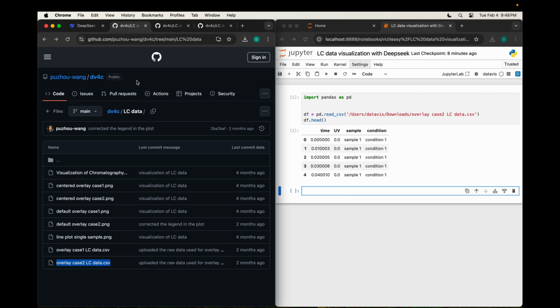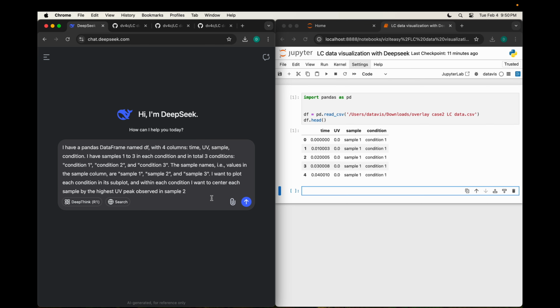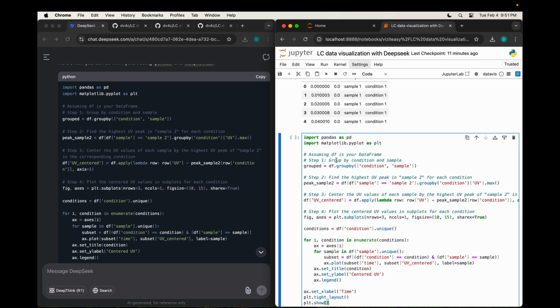So without further ado, let's jump right in, and to hopefully get a close to apples-to-apples comparison, I'll try to reproduce the same prompt we used last time for ChatGPT. All right, let's copy this and give it a try.